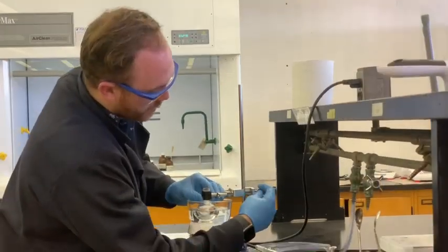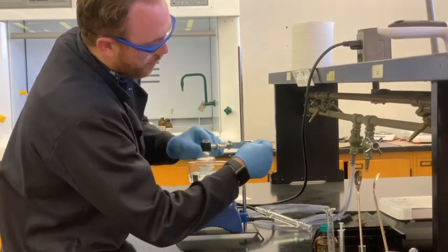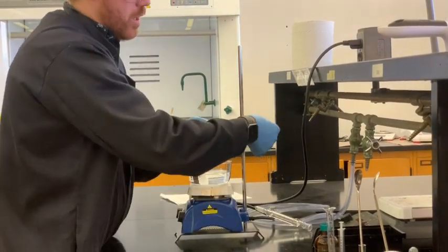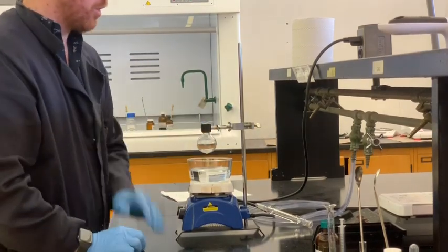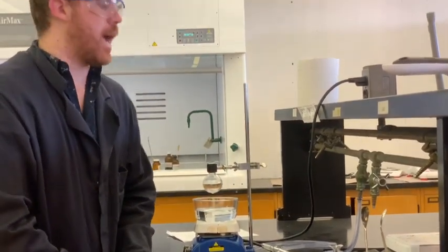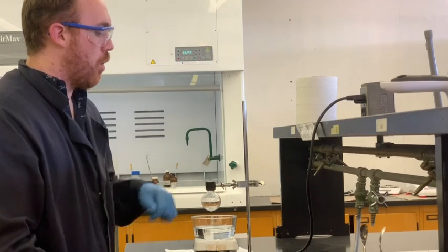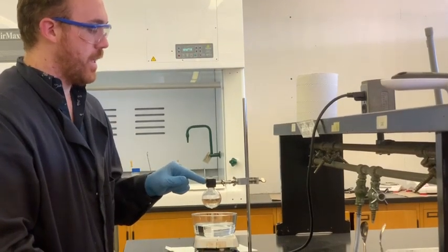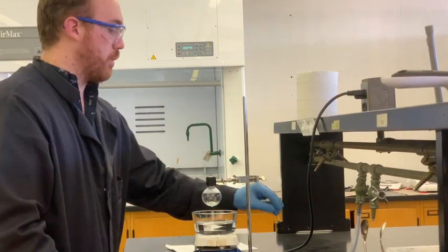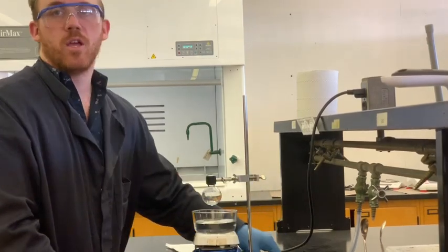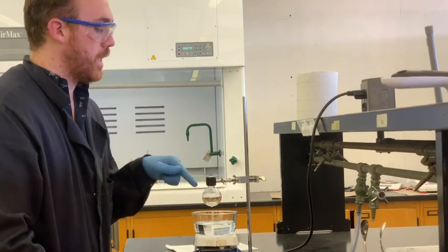You always want to make sure that you can kind of visualize what you're going to do if you have to stop the reaction really quickly. One of the biggest reasons that I like to always clamp the flask instead of clamping the condenser is it's much safer to be able to just remove the condenser when you need to. You have to put something into the flask.